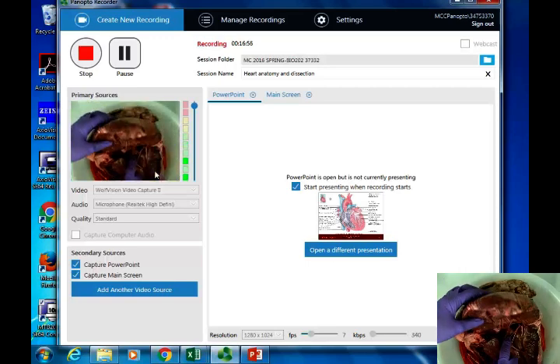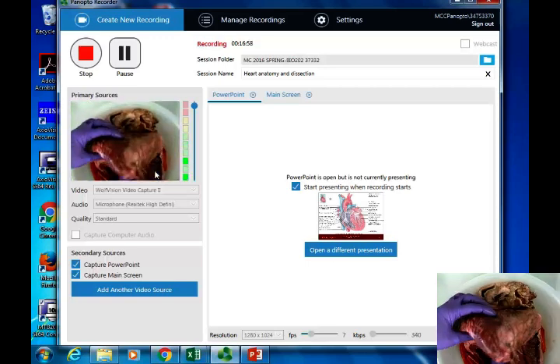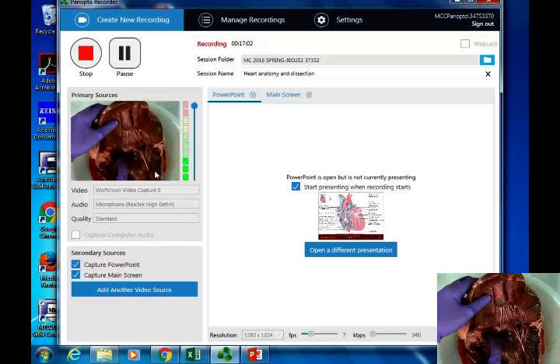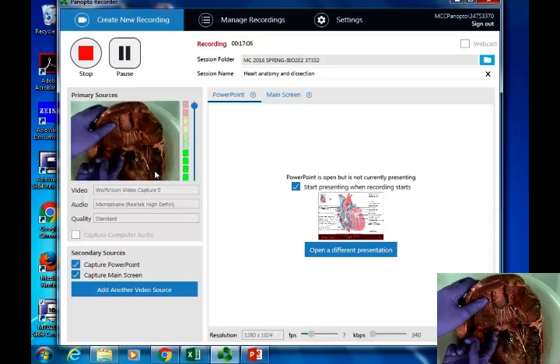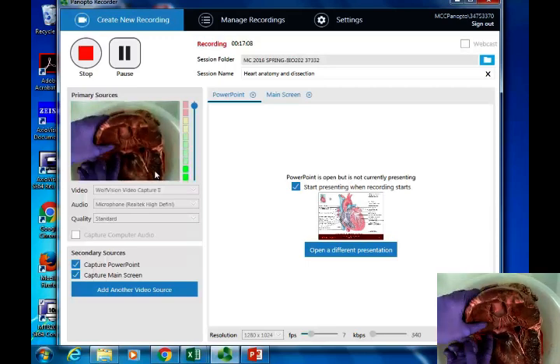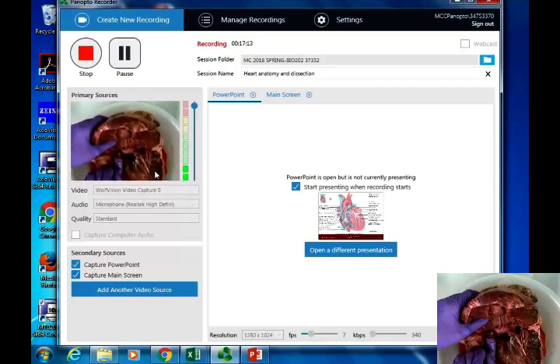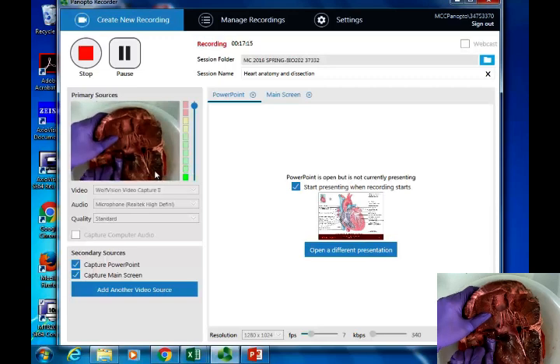In terms of working its way through, it actually passes over this way here. On the left side, this, and I'll put my finger in it, underneath it, but this is going to be the semilunar valve. Now the semilunar valve, there, see how my fingers, it's a little bit hard to see on the small screen there. My finger's underneath one of the cusps of the aortic valve. So again, these cusps are shaped like an umbrella, perfect for today with all the wind and stuff like that.